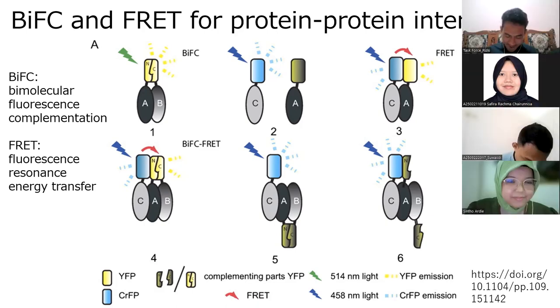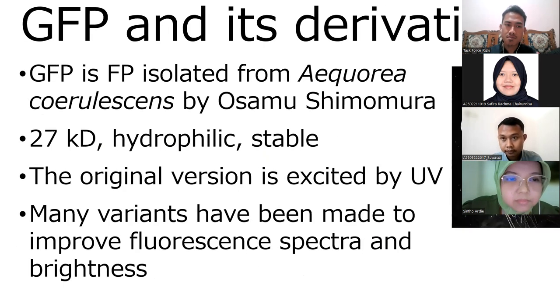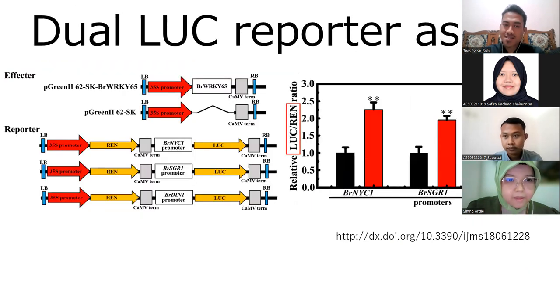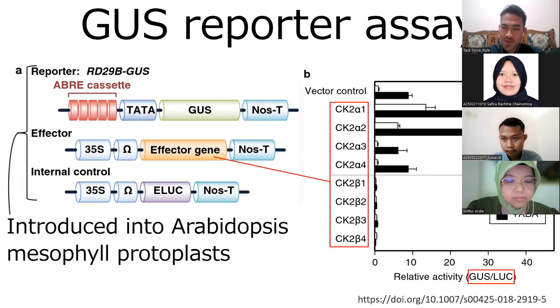And I also want to ask about the vector gene that you mentioned before, which may enhance the GUS result. Is it just a specific gene for enhancing GUS expression, or can we use it for other purposes, like increasing gene expression or targeted gene expression, or is it specific for GUS?